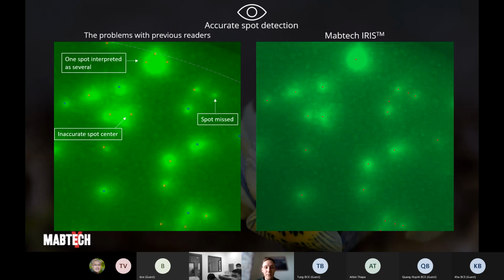But if you have misplacements like this, it could be the case that you have incorrect data categorization, that the data is saying that you had two cells sitting next to each other, one secreting the green cytokine and one secreting the red one. So this type of data collection, in short, contributes to wrong data analysis. What you're going to analyze is not going to be correct.